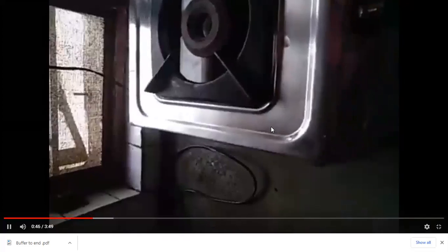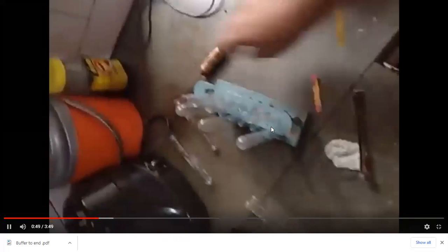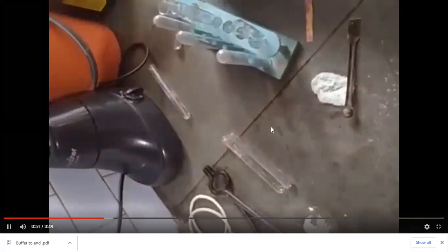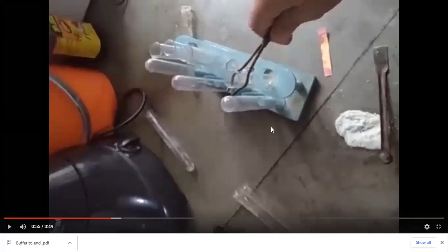Now I am going to heat these crystals on the gas cylinder, my dear student. You can see that I hold this test tube with the device called test tube holder. And you can see I am going to heat it now.